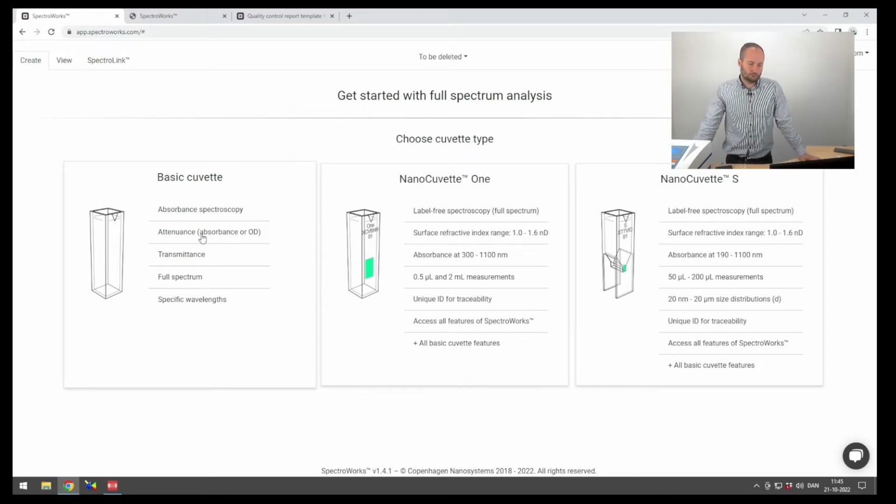I think it's really an innovation which takes a little bit of time for people to accept. But yes, I think we are fully acceptable. We can see what's happening.